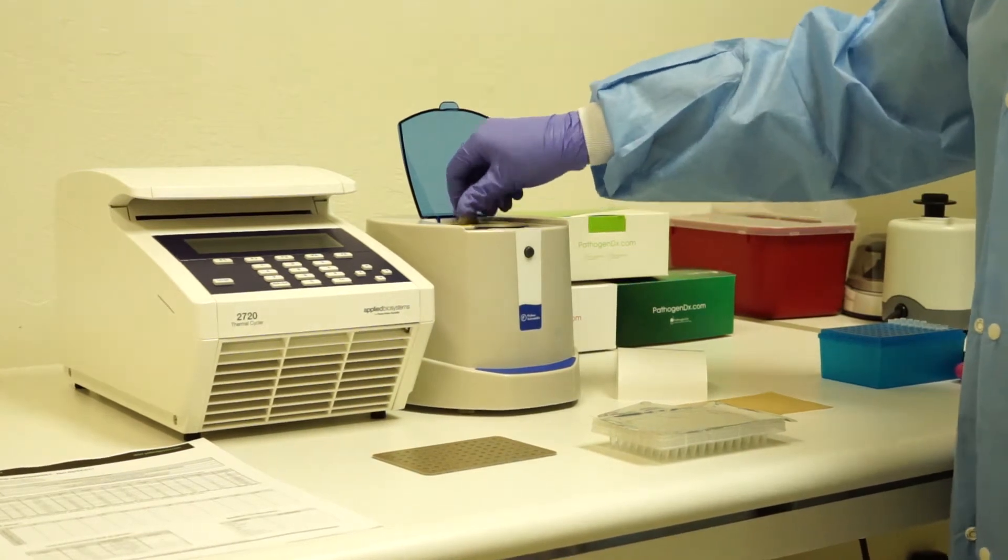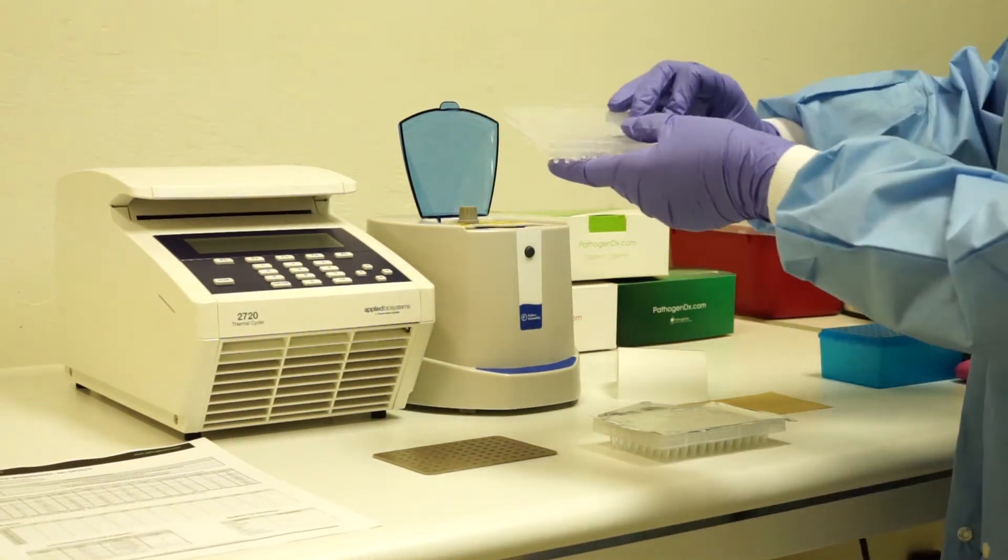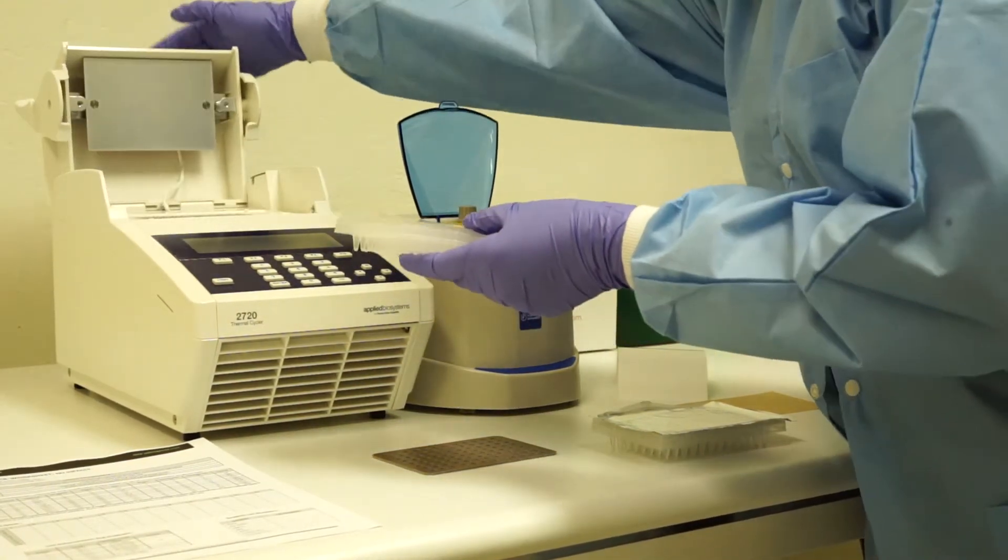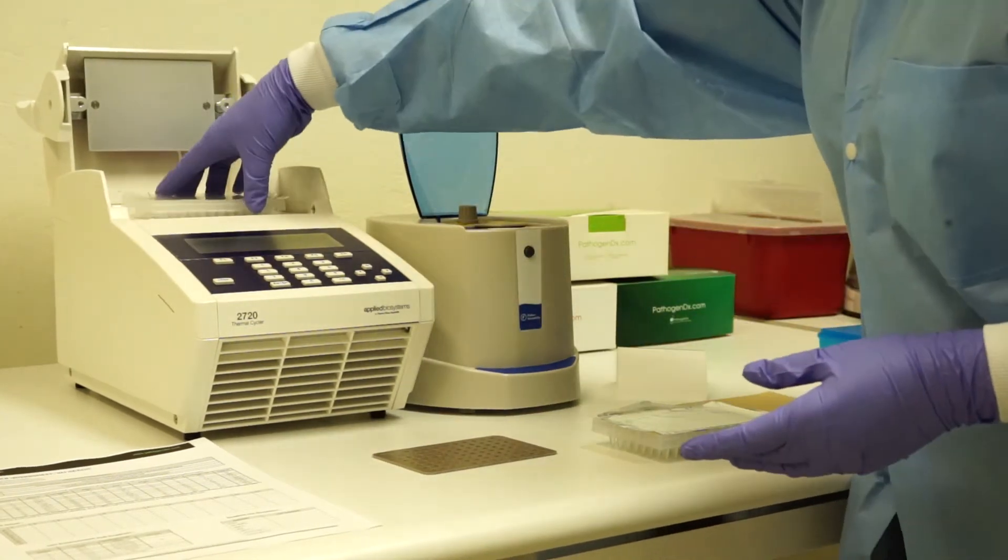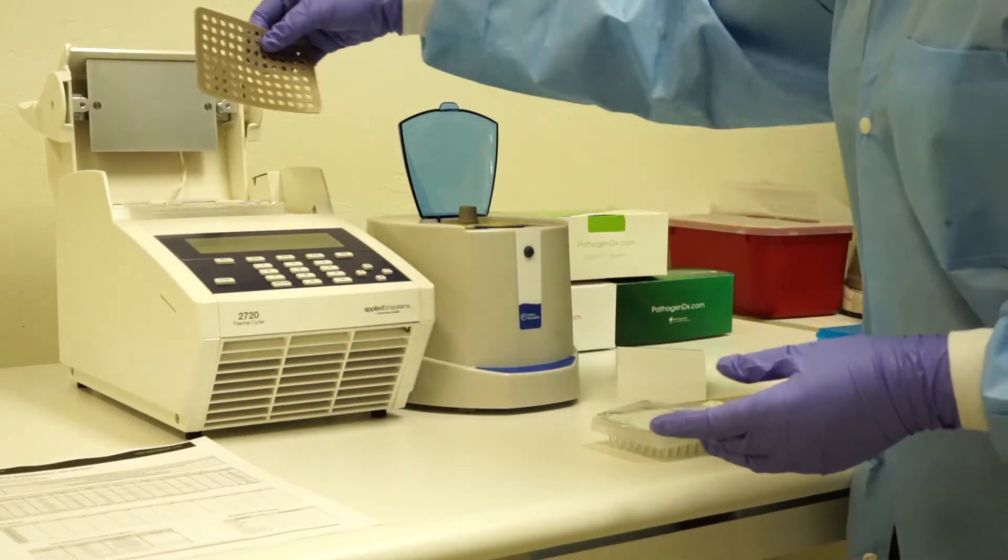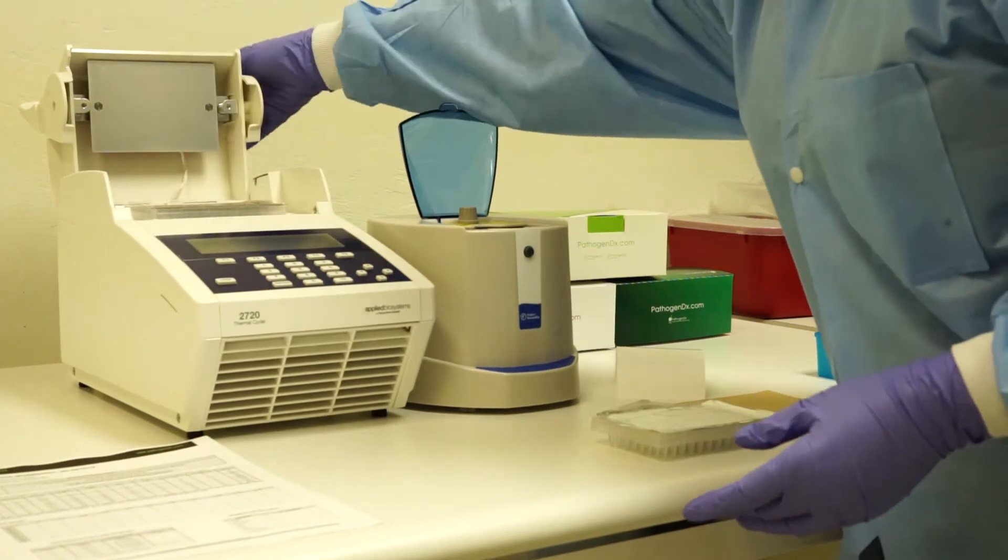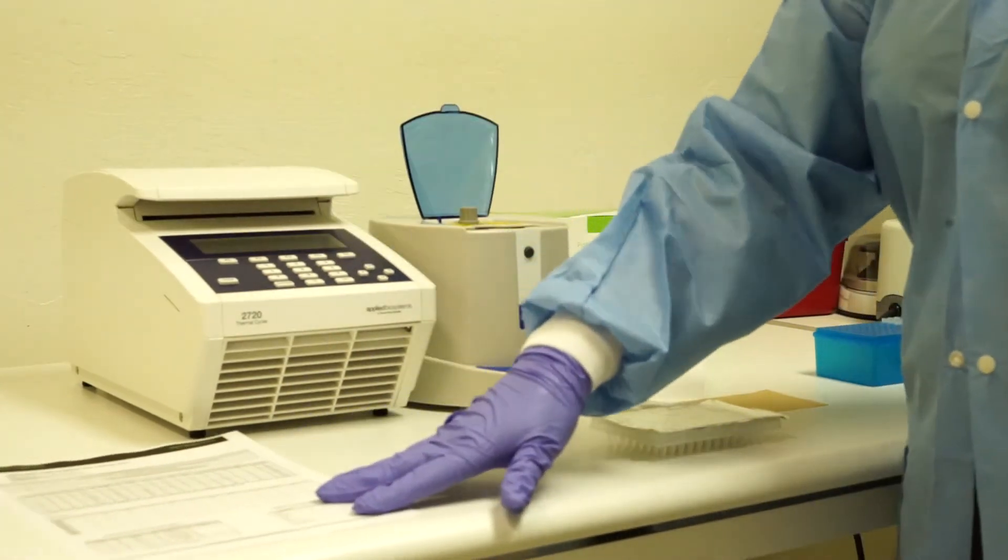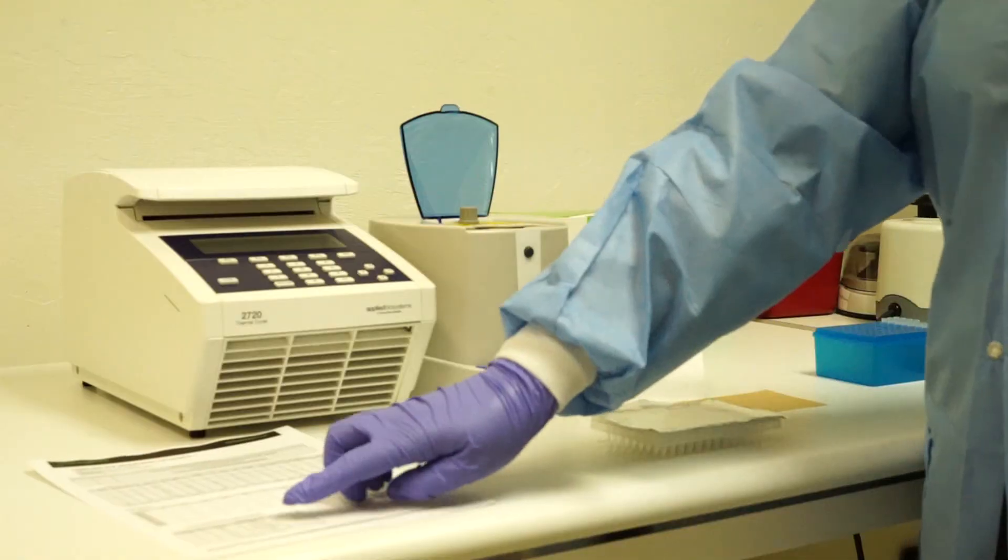Once the plate has spun, place your labeling PCR plate into your thermal cycler with the pressure pad brown side up and follow the program set on the labeling PCR worksheet.